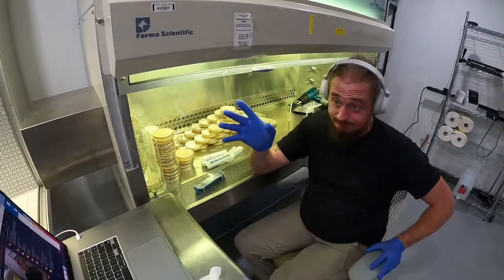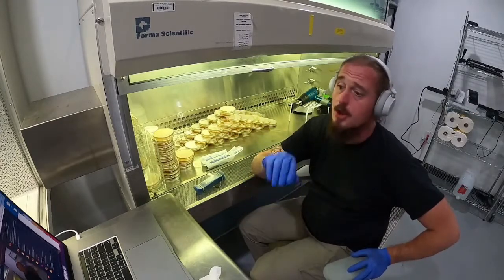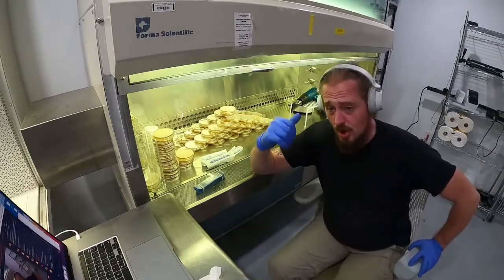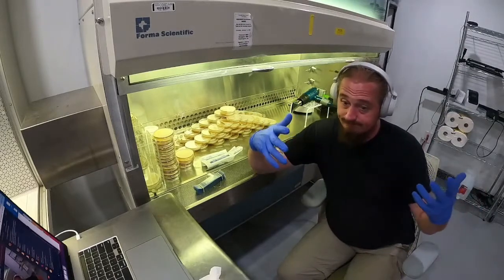So spores. Don't inject spores to grains, substrates, and things like that. Your best bet is to sit down, put it to agar, let them breed, let them mate, let them isolate.